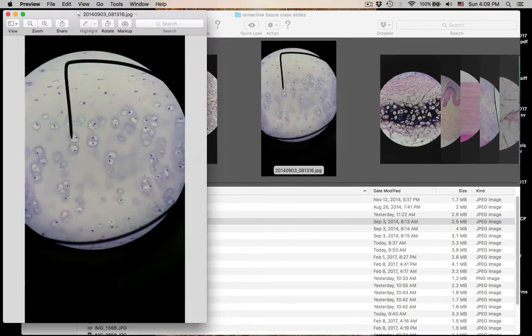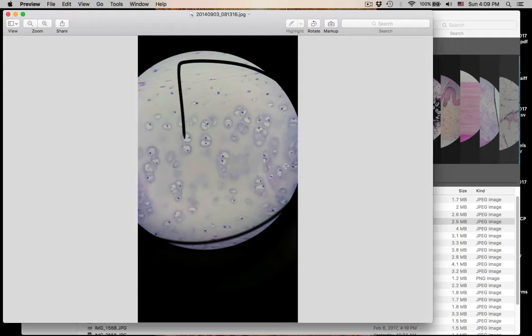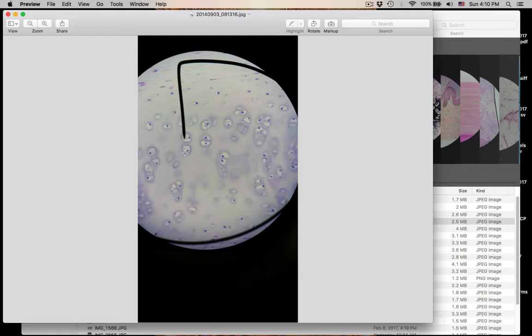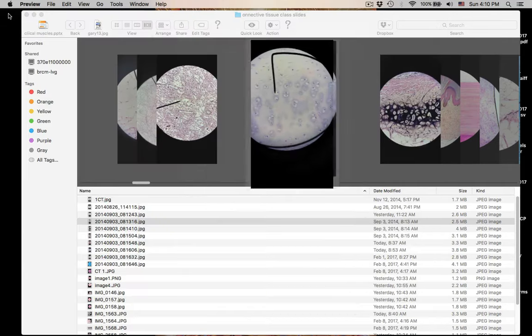Number four is hyaline cartilage. Remember, you cannot just say 'hyaline' — you will get it wrong. Its name is hyaline cartilage. The matrix has that glassy appearance. These little white things are lacunae. Inside all these lacunae, what cell lives there? Chondrocytes — chondro means cartilage, so chondrocytes live in their little lacunae, secreting this matrix. Remember the matrix is non-living — it has protein fibers and ground substance.